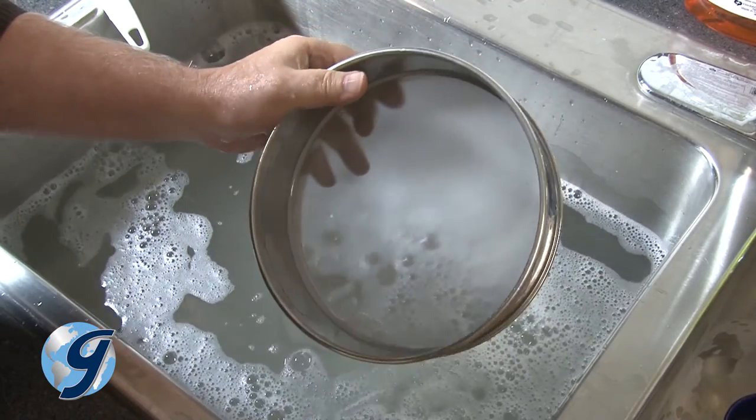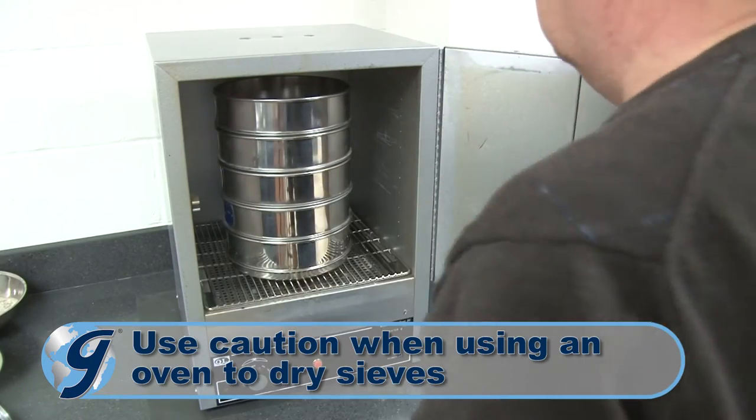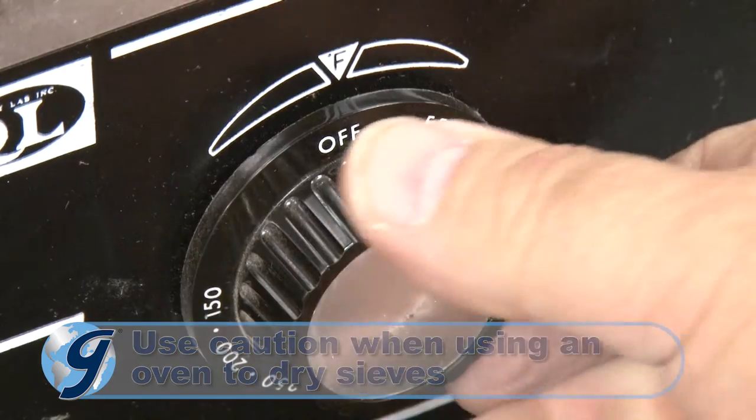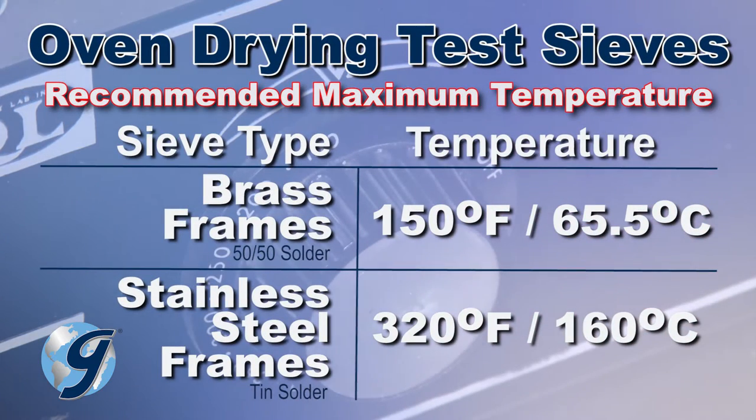After washing, air drying sieves is recommended. But use caution when using an oven to dry sieves, as excessive heat may soften the solder or epoxies used in assembly and cause the tension cloth to pull away from the frame.